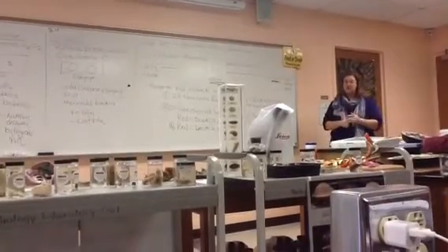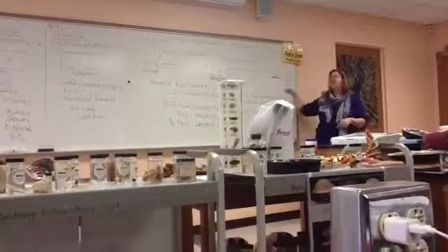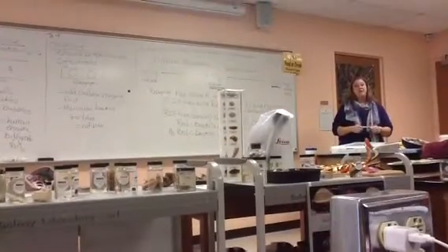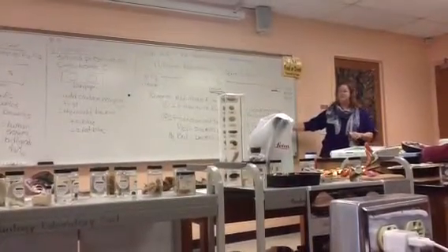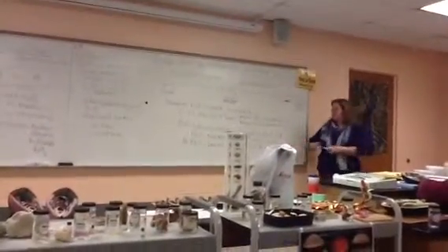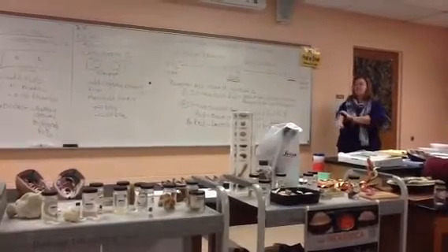Now, I would just caution you on quizzes and tests. I know I put both up here, but I need to know that you know what both is. Okay? They're negative for nitrate respiration and negative for denitrification. So be as clear as possible. So wait a minute, you said positive for nitrate respiration and positive for denitrification? No, the bacteria are negative for both. Negative for nitrate respiration and negative for denitrification, right here where I said both. The chemicals did it, not the bacteria.